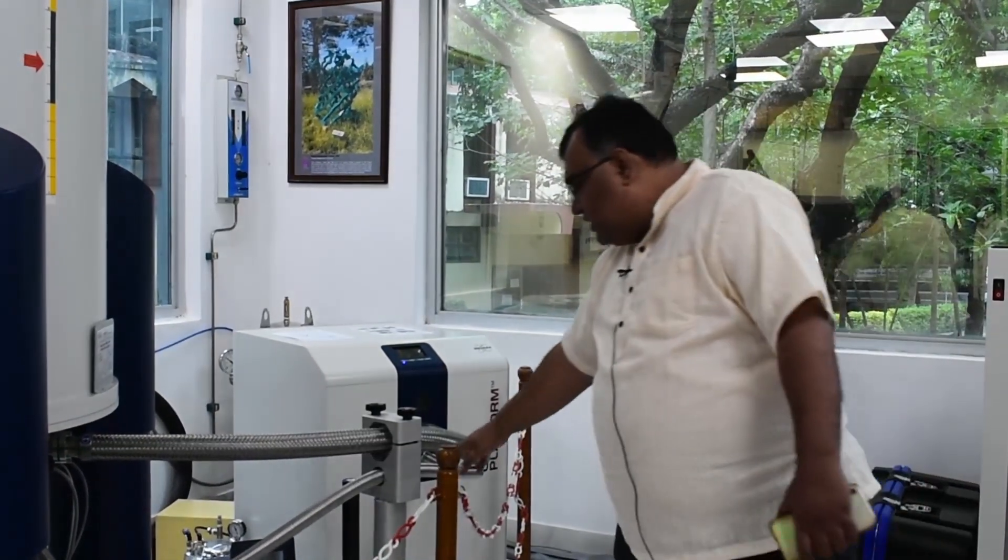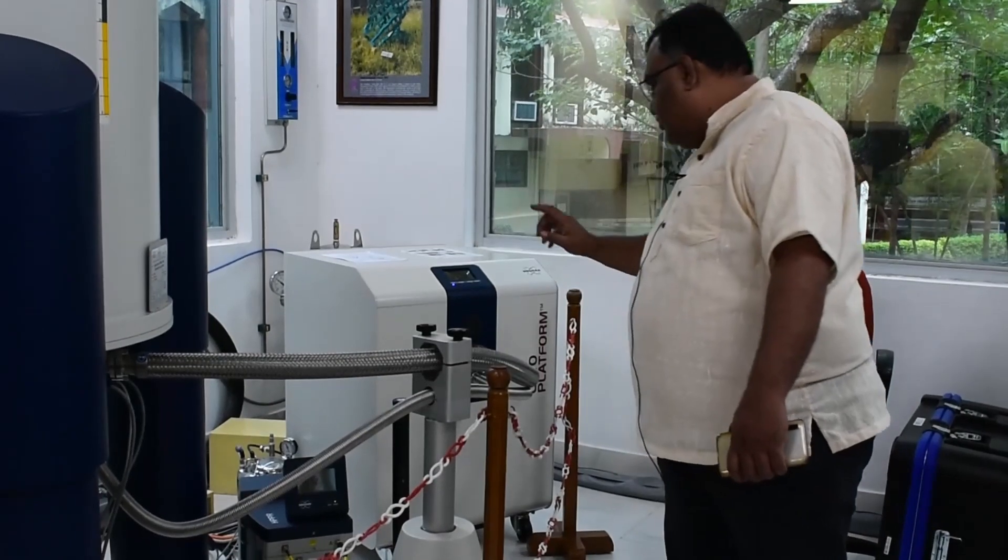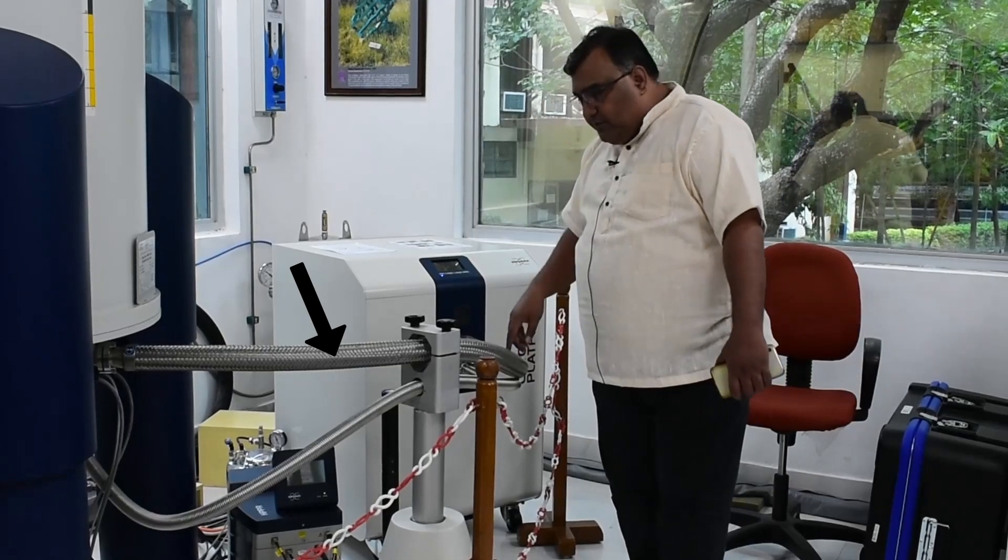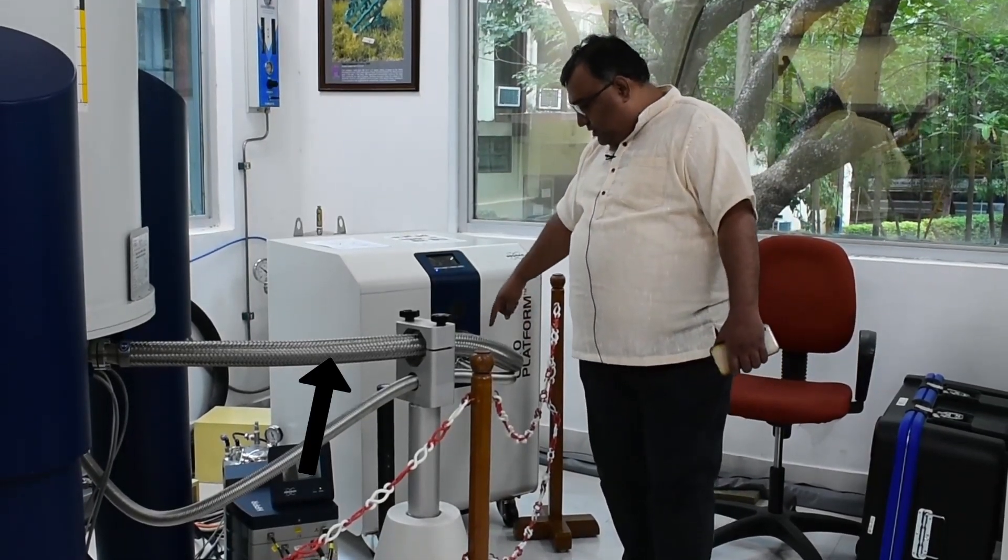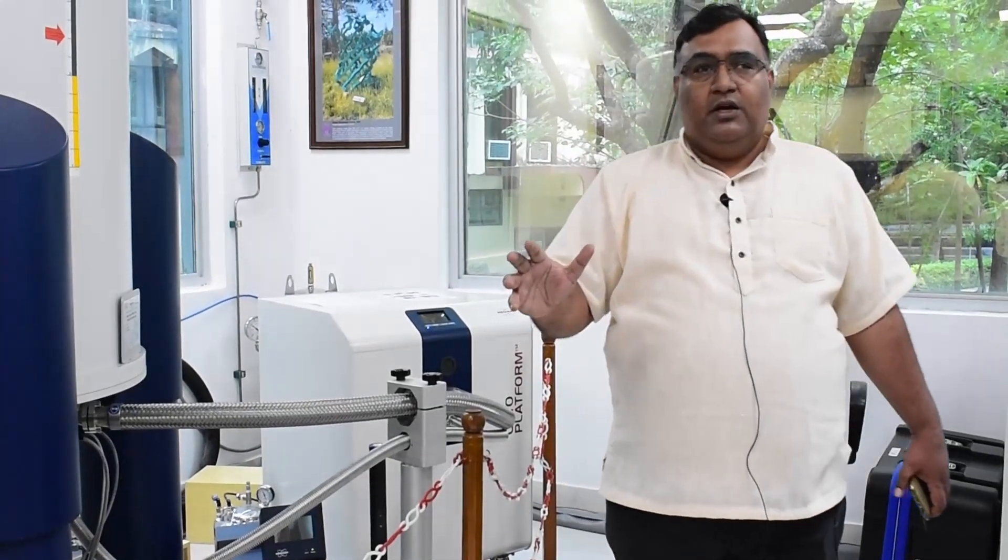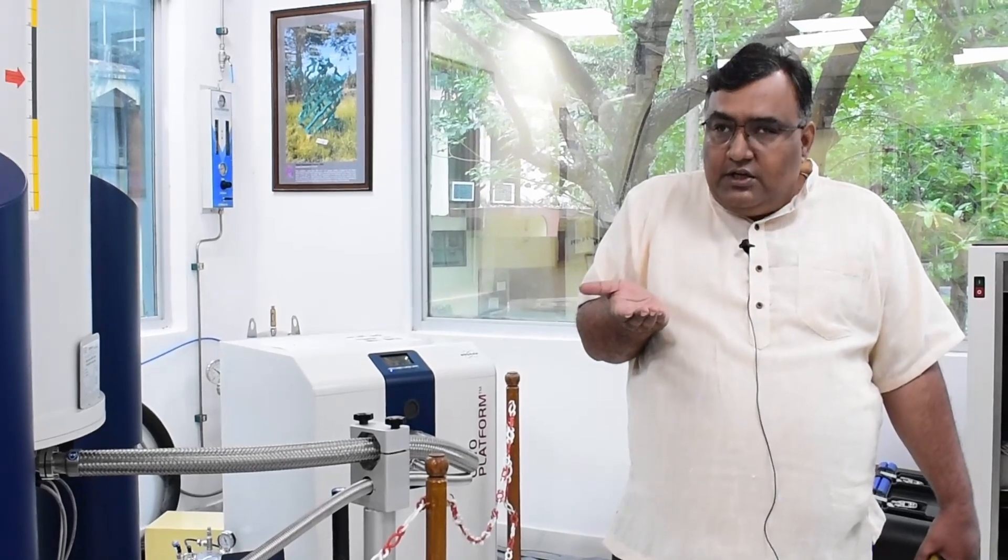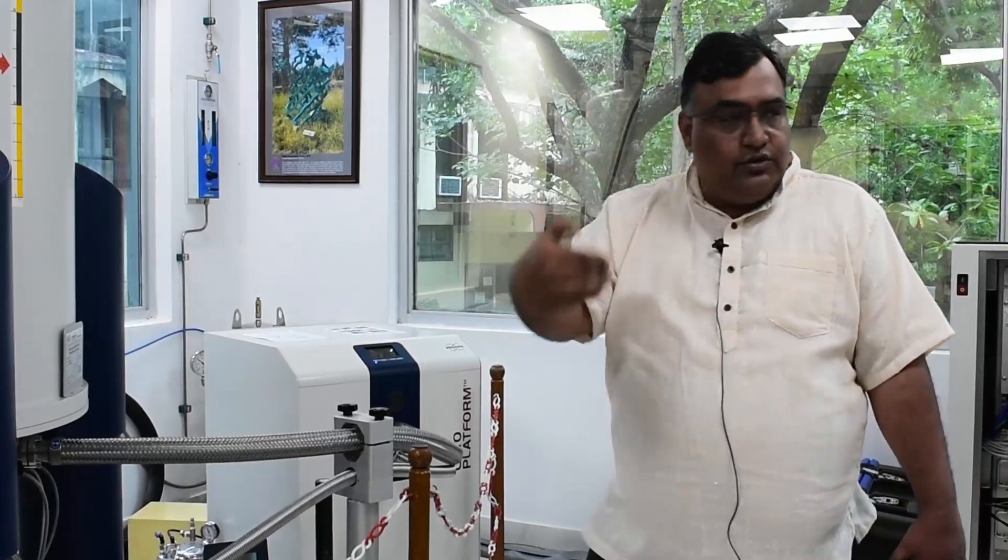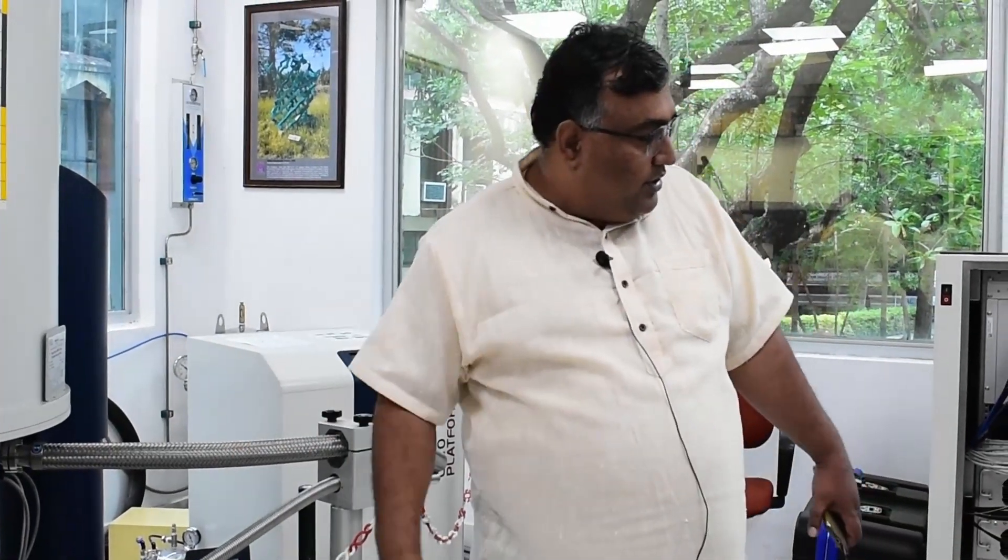This line creates a vacuum inside the probe, inside the platform. Once the vacuum is created, the helium is cooled and cold helium is sent from here and return helium also comes from here. Because every time you apply radio frequency pulse, you are going to generate some heat in the system. That heat is going to increase the coil temperature little bit. When the increase in coil temperature happens, the gas has to return to here and get further cooled.